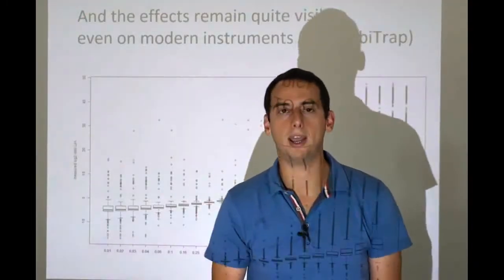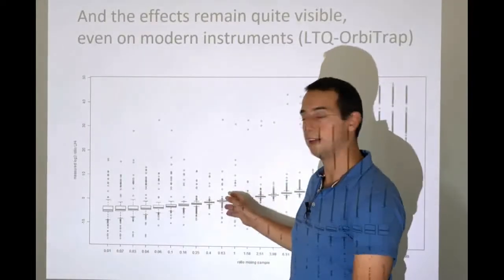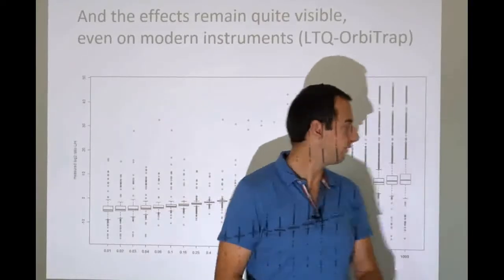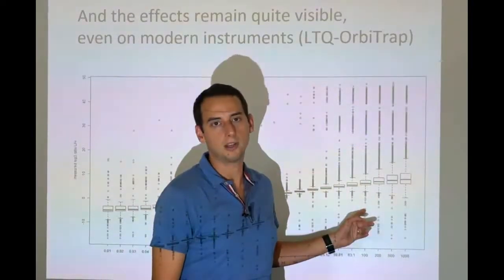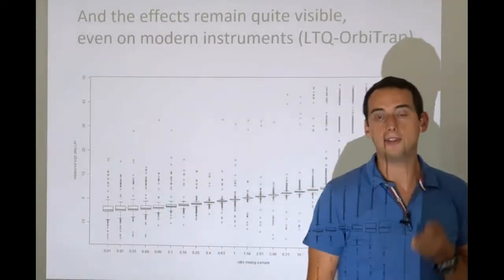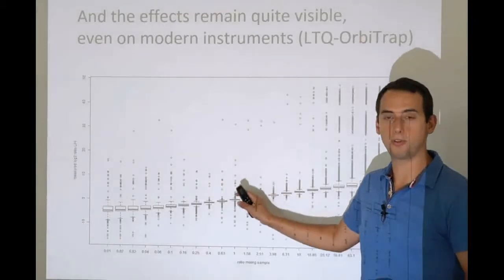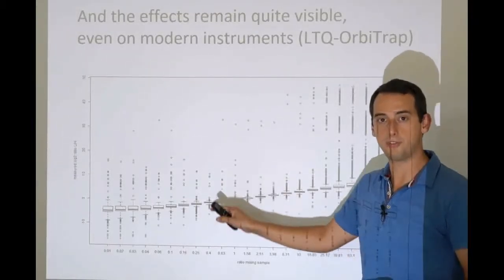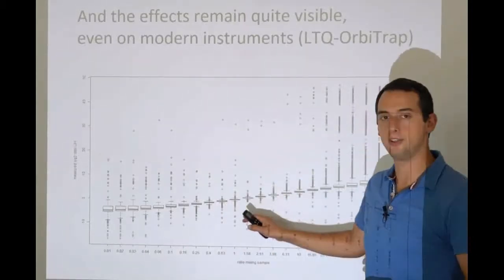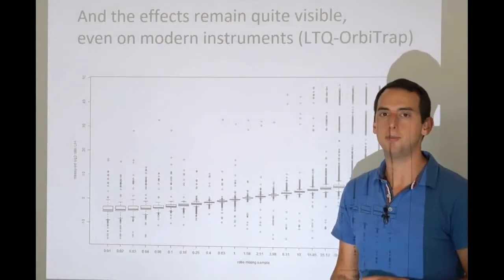We can get a much more accurate measurement. But that is really crucial if you want to do it right, because our detectors are imperfect, and if you happen to spike in somewhere here or somewhere here, your measurement is essentially useless. So keep that in mind. These detectors are not perfect, and there's nothing you can do to change that. We've looked at more than 12 years worth of detector evolution over these past 3 charts, all the way from 2005 to 2014, and what we see is the detectors are not getting better. They have reached their limitations.